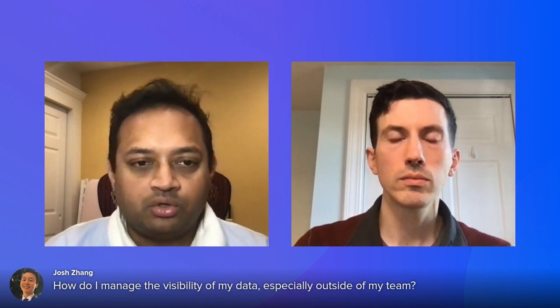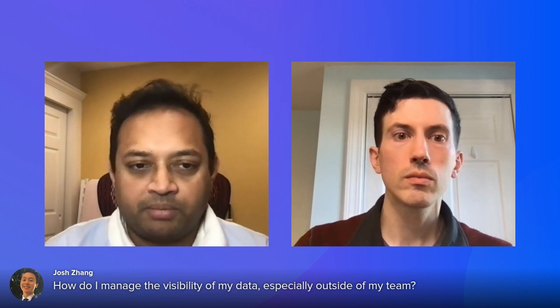How do I manage the visibility of my data, especially outside of my team? I think this is worth answering because we discussed access policies and permissions. Maybe we can layer on how some of that can be used to manage, let's say, a CRO collaboration, and we mentioned that in the presentation as well. Like how that would be set up. Can you talk through an example, Tom?